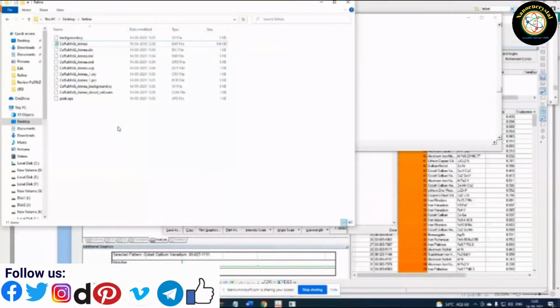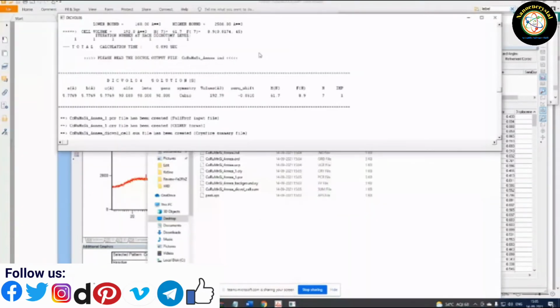Is everybody clear with this information, these steps so far I have done? Hello. Yes, sir. Up to here everybody is clear.